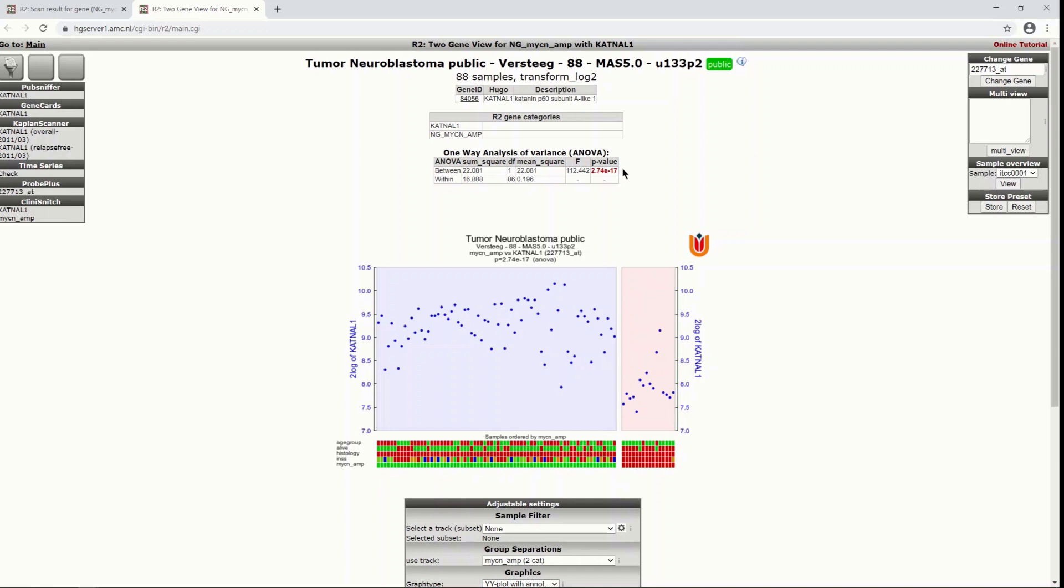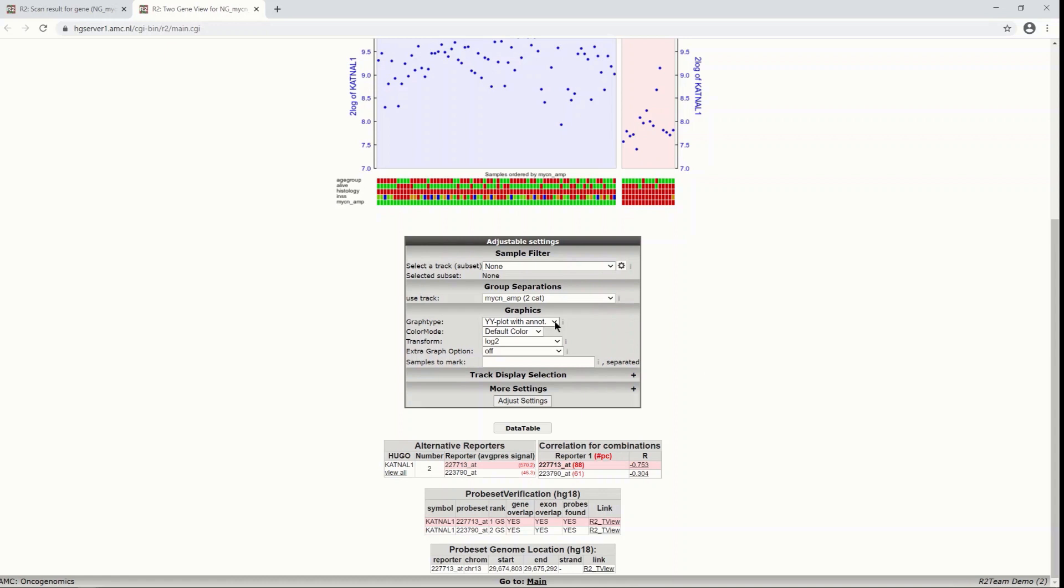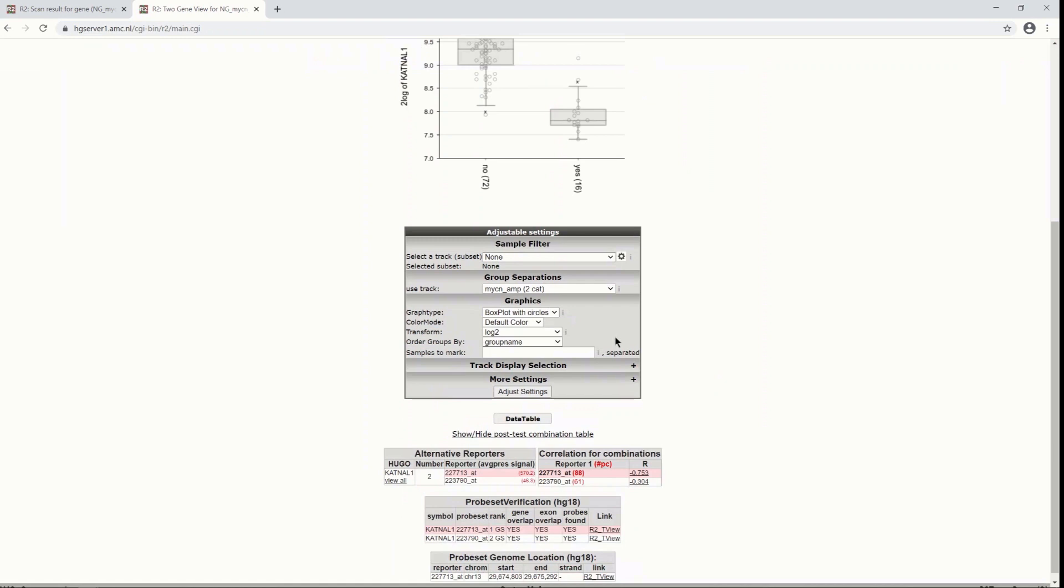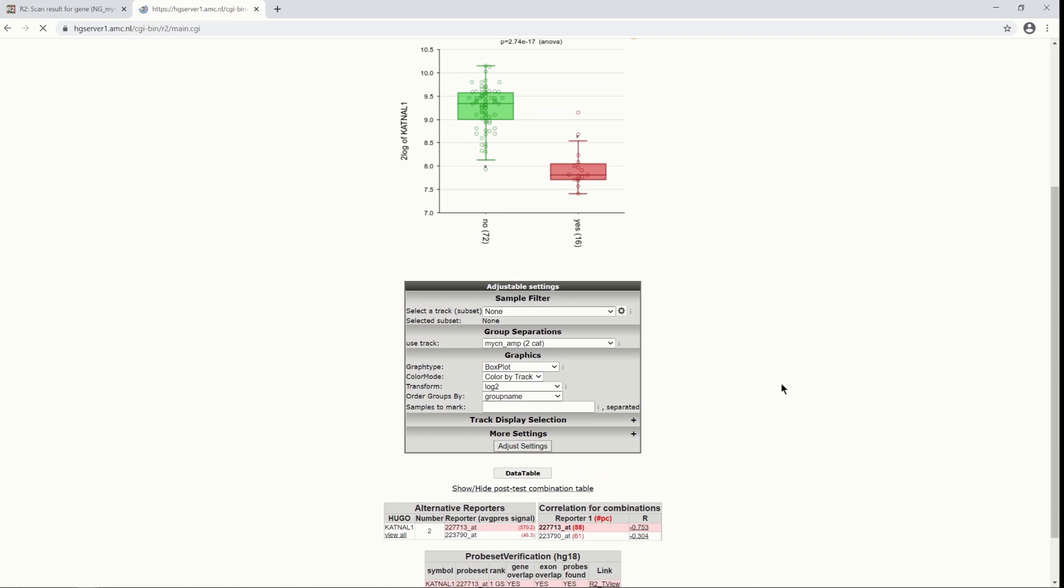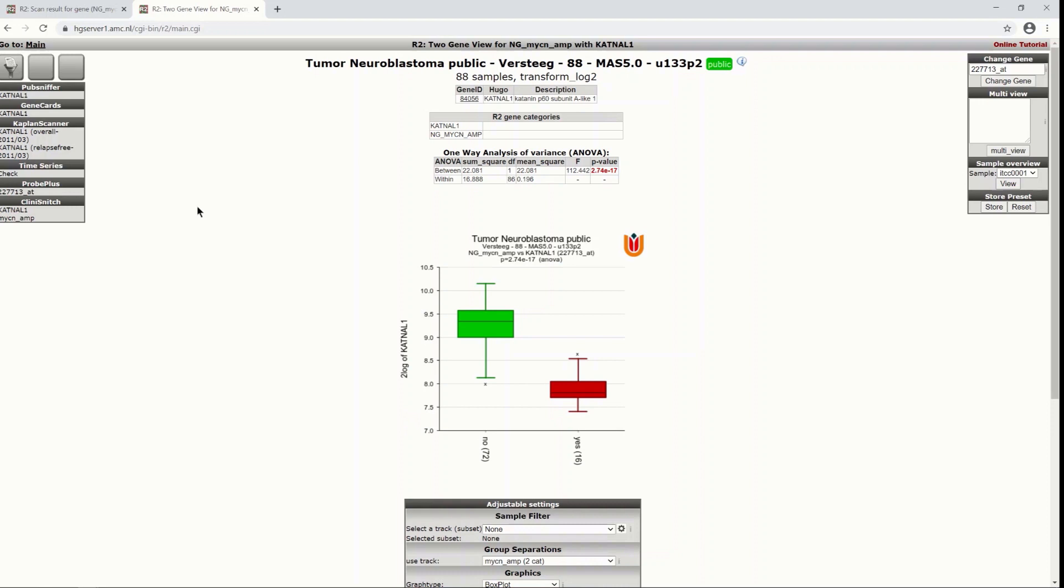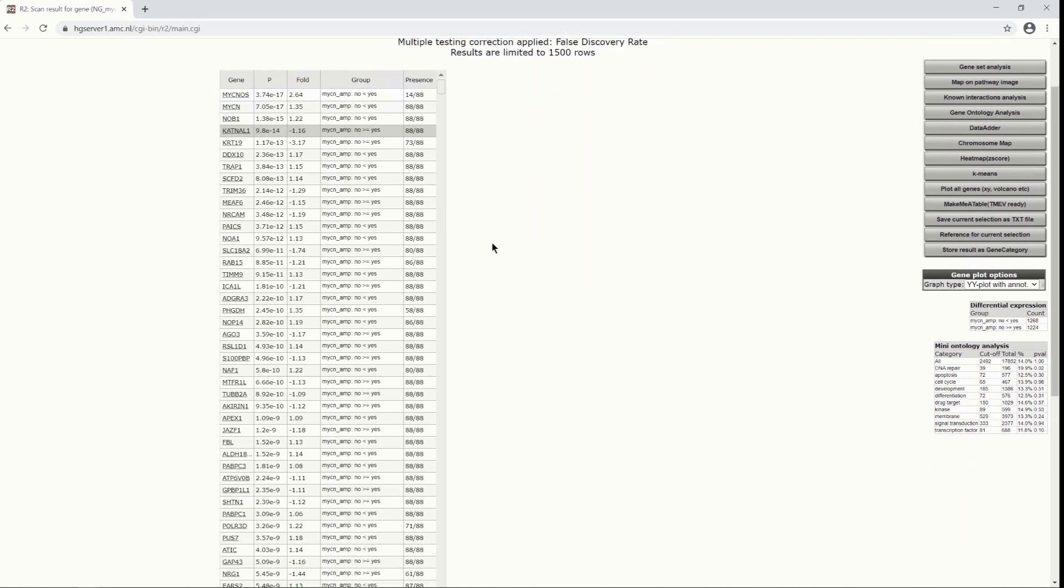And under here we can again adjust the plot to for instance box plot with circles or and that's also color by track for visual effect or good old box plots and you have all the statistics there of this one gene. We still have the other windows open here so we are back at our results list.